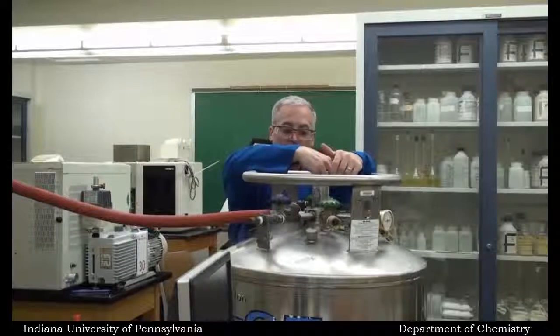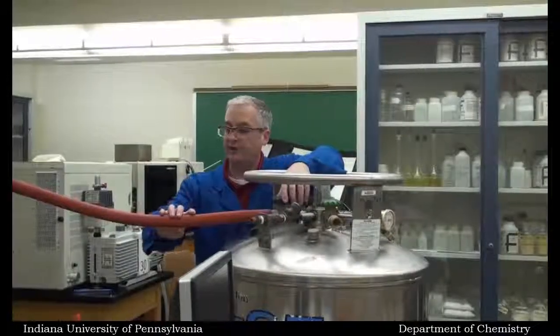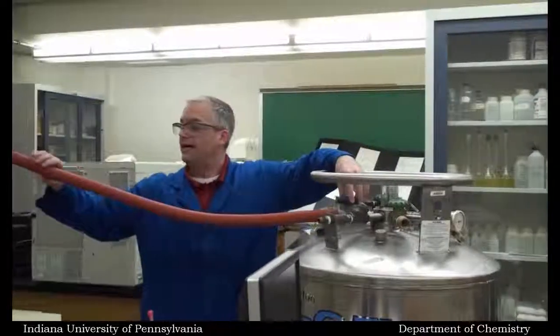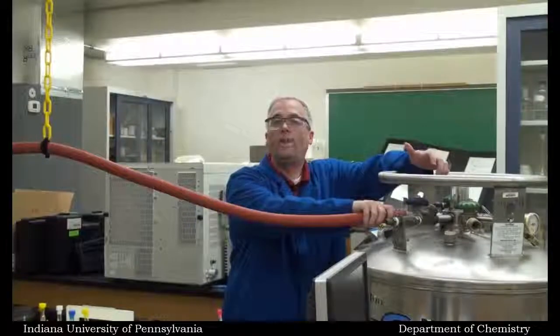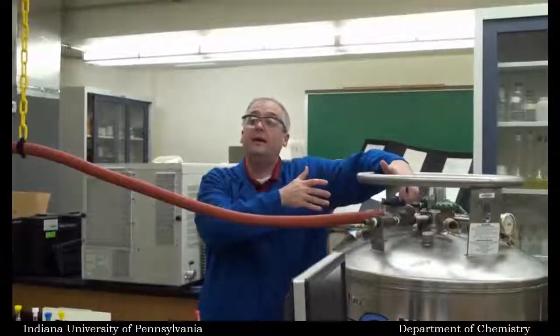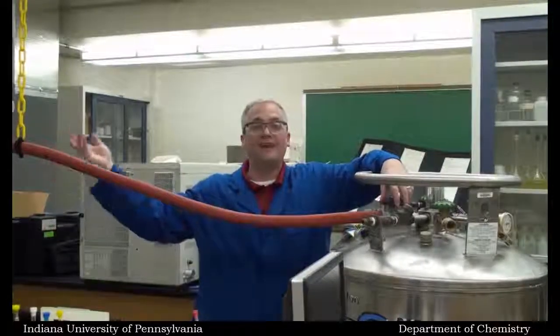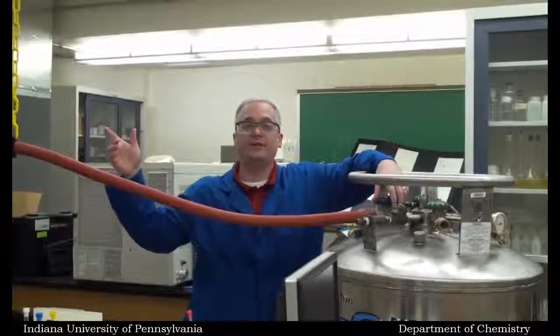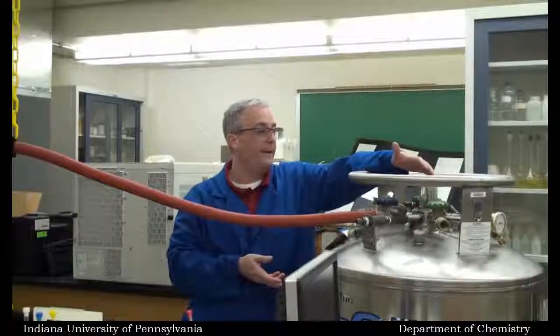And as this high pressure comes across this, it's going to be at extremely high velocity. Again, we have this cold, we have it very, very brittle, so we don't want much force. So we can't open the valve as much. Therefore, we can't get as much liquid out of the tank into the Dewar as fast, even though it sounds like it is because there's a greater pressure.